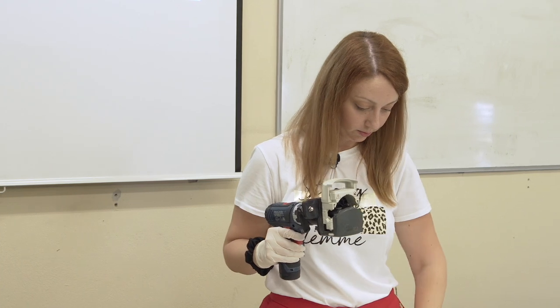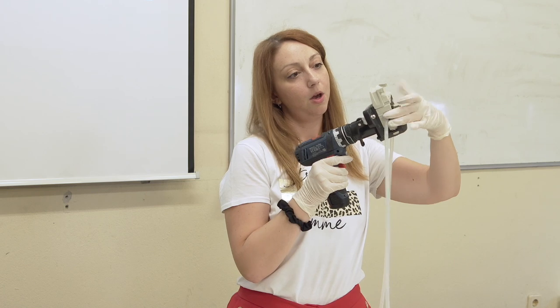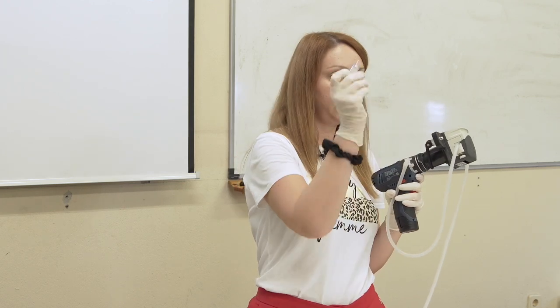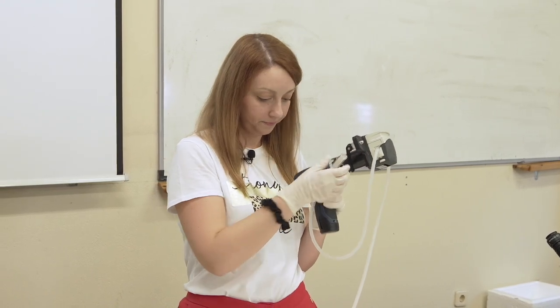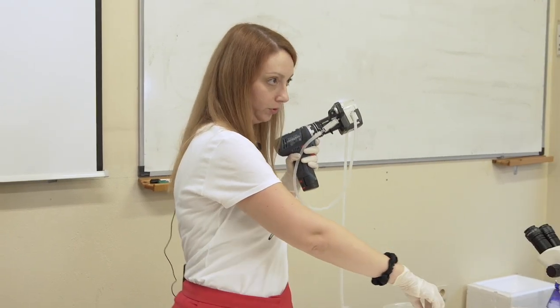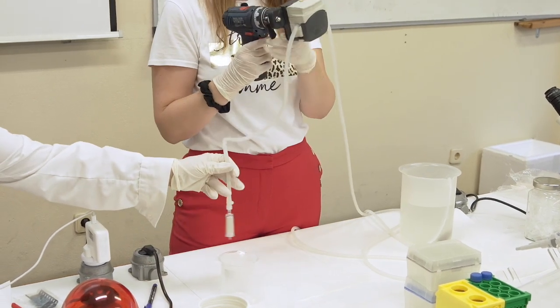So, when we want to use it, we just open this one. We put the hose, and on one end, we adapt the filter. There are different types of filter. And we put the other side into the water. And we start, press the on-off button.